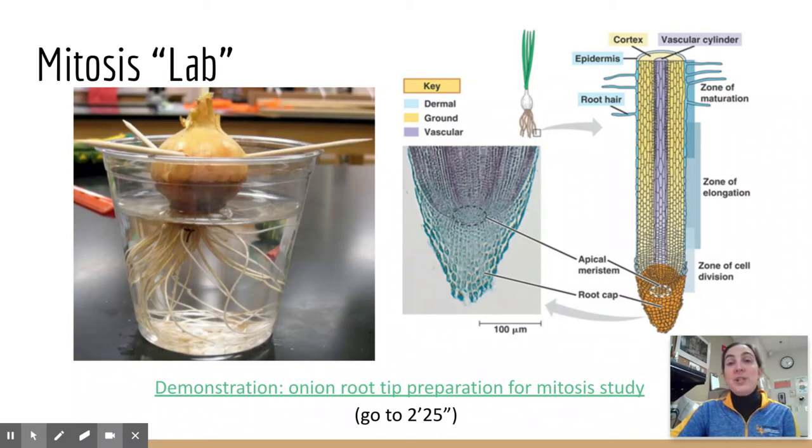The first question in the Mitosis Lab asks you to design an experiment. And when you do that, I would like your design to have a protocol similar to what we just talked about. It should be based on looking at slides and counting how many cells are in mitosis. The reason that's important is later on in the lab, it will give you some hypothetical data that you might have gathered from that lab, and it makes a lot more sense if your data matches your procedure.